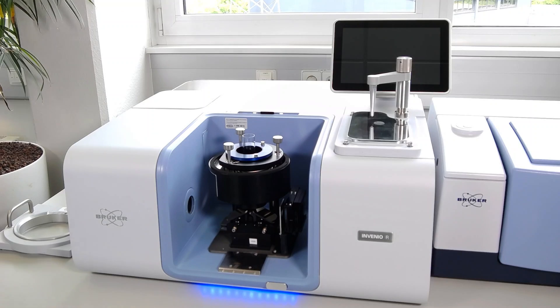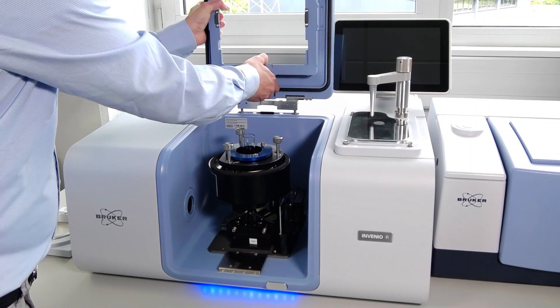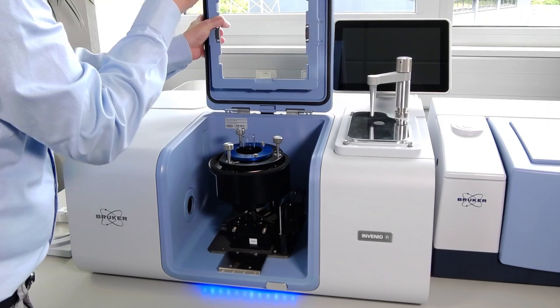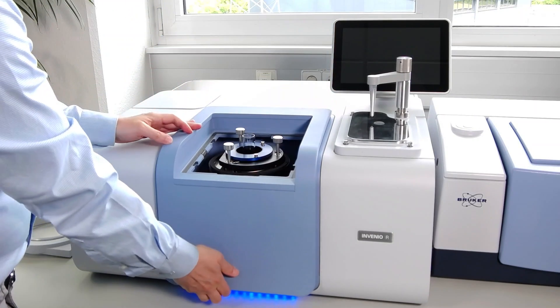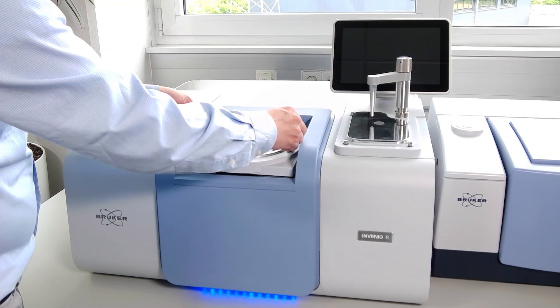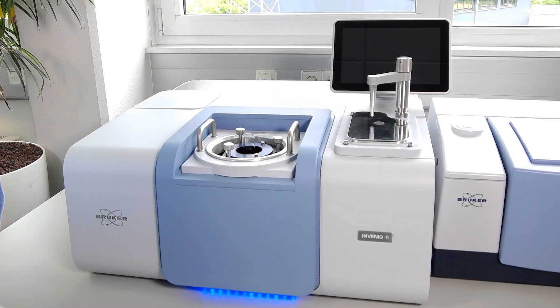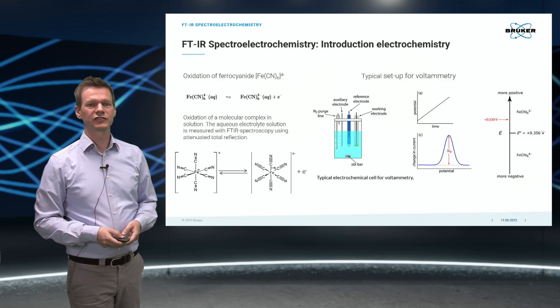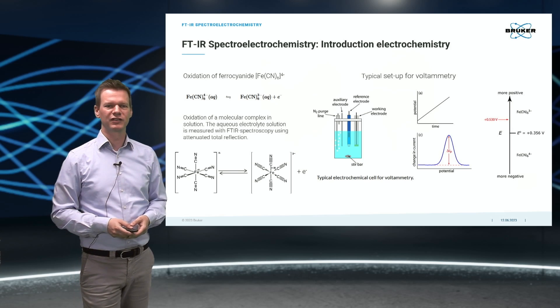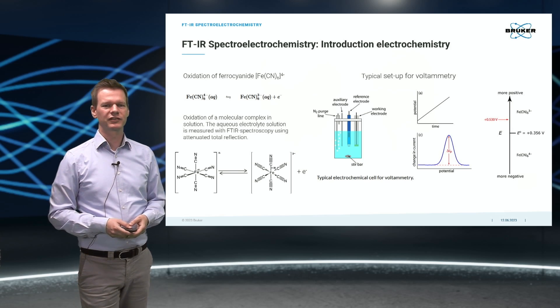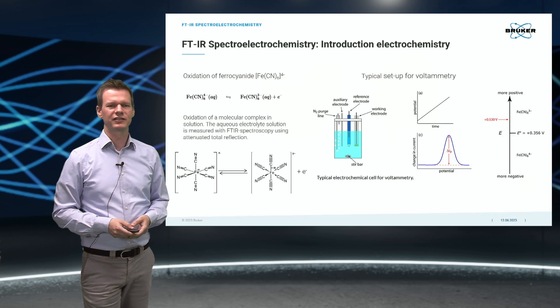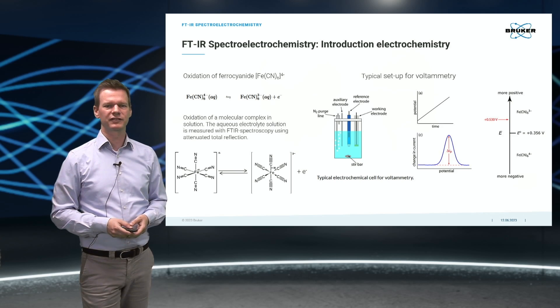Finally, the sample compartment cover of the reflection unit can be installed. This allows access to the electrochemical cell from the top during the reaction. The reaction presented today is the oxidation of ferrocyanide, a molecular complex. After oxidation, the iron center of the complex changes its oxidation state, resulting in differences in the bonding strength of the cyanide ligands.